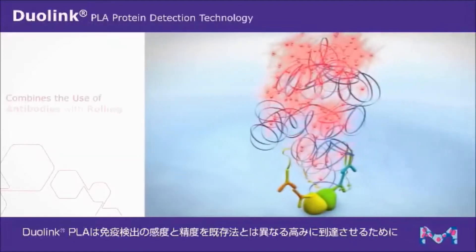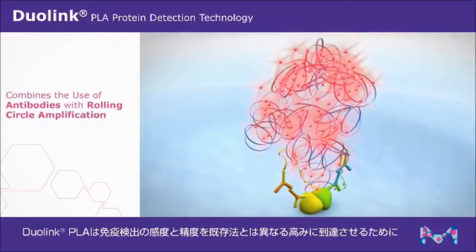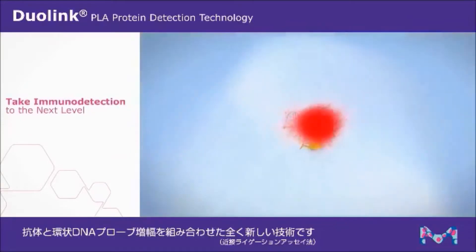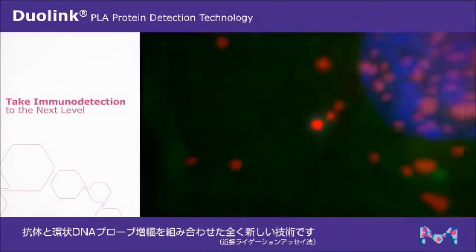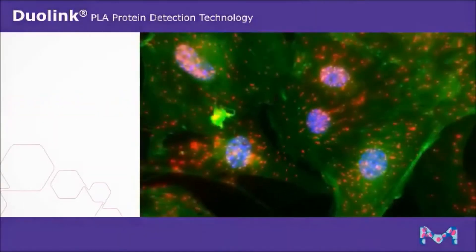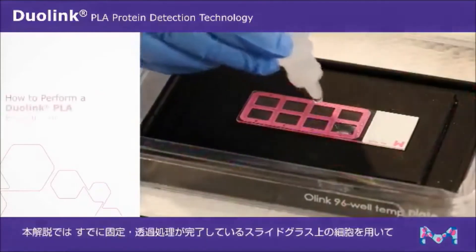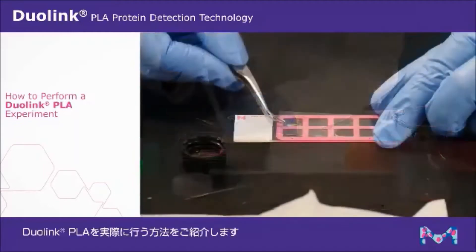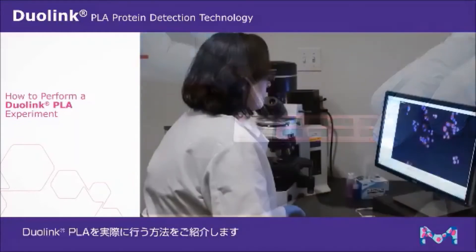Duolink PLA is an innovative technology that combines the use of antibodies with rolling circle amplification to take immunodetection to the next level. This video will show you how to perform a Duolink PLA experiment with cells on a slide that have already been fixed and permeabilized by the user.